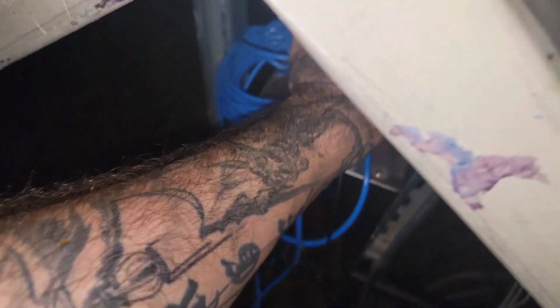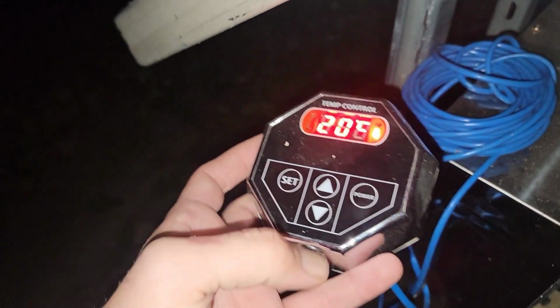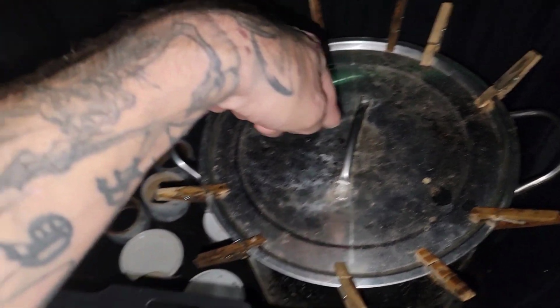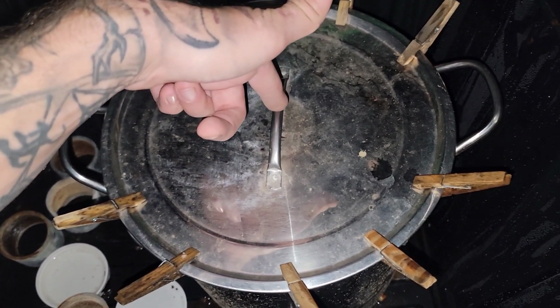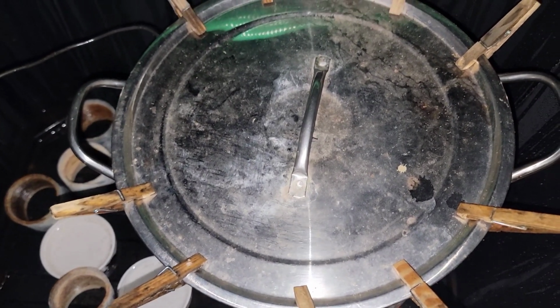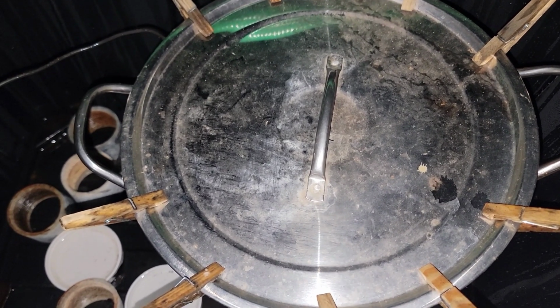So now I'm just gonna come back here and make sure our temperature's set before we put the lid on for it. Set it at 55. Now you might be like, 55 is only 135 Fahrenheit. You're correct. But what will happen is as this heats up, the outside will heat up faster than the inside. So the outside of this will get up to around 190, 180. By the time this reaches 135, I suspect we'll come out and check our timer in an hour, and I bet you that our PID will be reading a lot higher than 135. So let's see you in an hour.